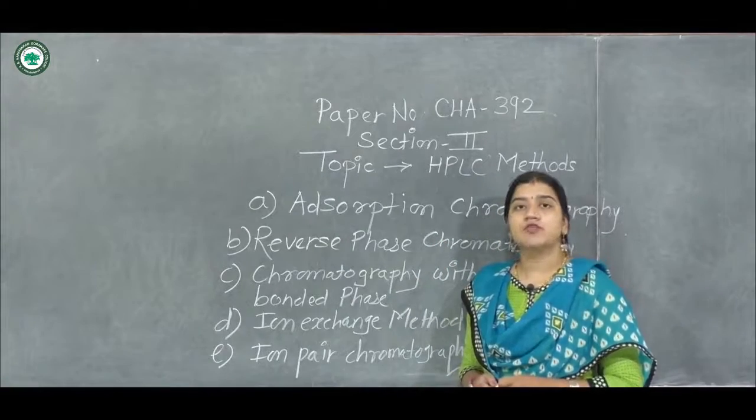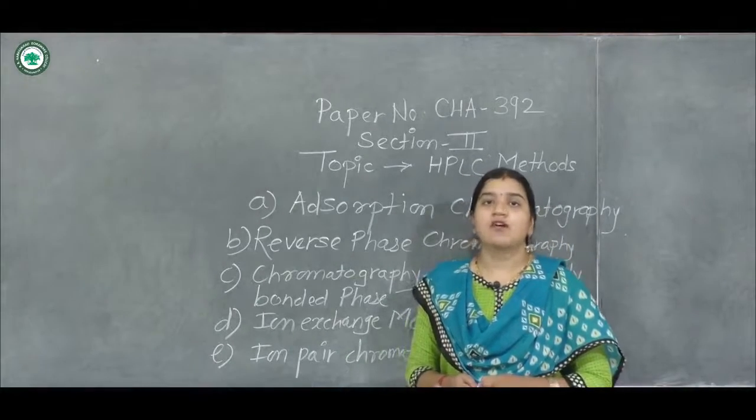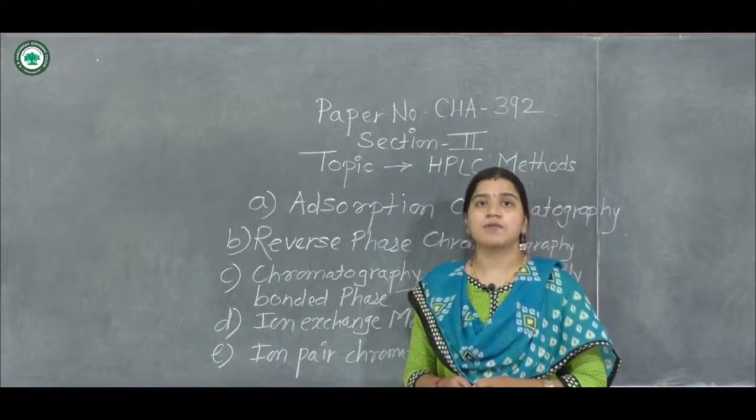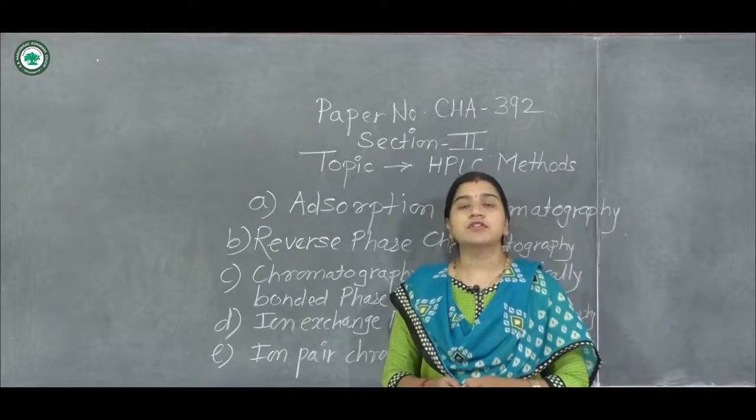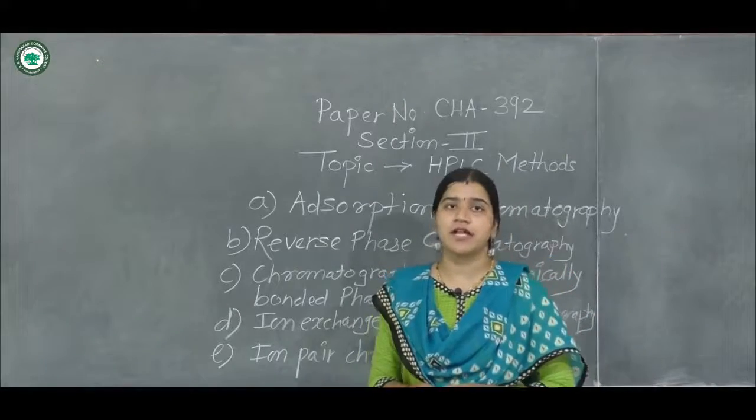To begin with, today we will start with adsorption chromatography, also known as normal phase chromatography. Before starting the actual discussion, we will start with the syllabus.